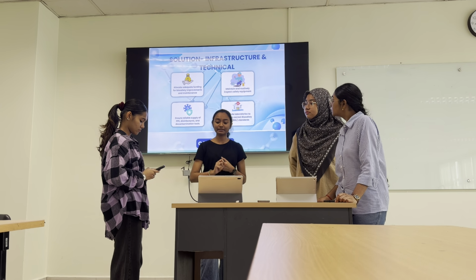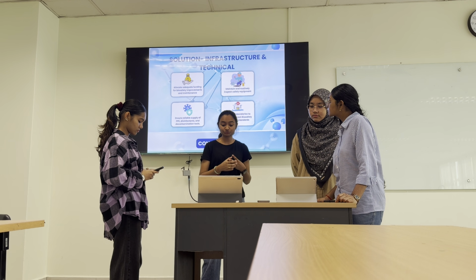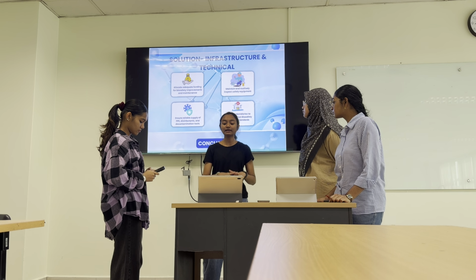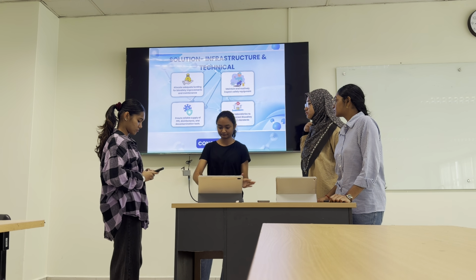And secondly is maintaining and routinely inspecting safety equipment. Thirdly is ensure reliable supply of PPE, disinfectants and decontamination tools. And finally upgrade laboratories to meet the correct biosafety level standards.